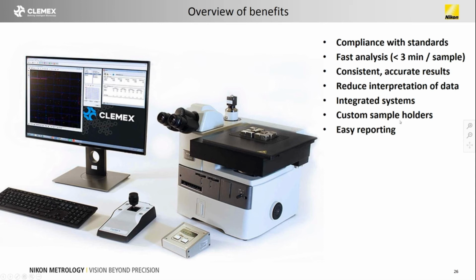We can create custom sample holders. So if you don't have standard shaped samples, we can create a sample holder for that. We have a machine shop here. And easy reporting. So once you're done with your analysis, we can export that to Excel.